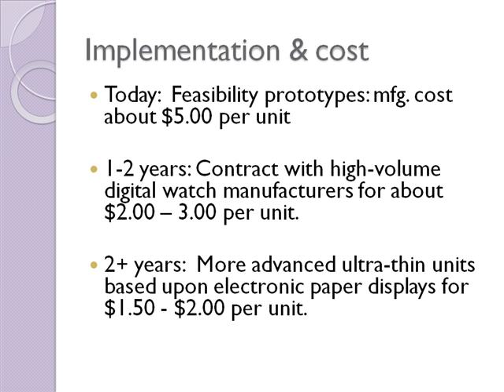In terms of implementation and cost for this approach, these little prototypes I'm showing here cost $5 per unit. And again, these were made on a really low budget just to show the concept to folks. If we got serious about this, one way to go might be to contract with high volume electronics manufacturers, for example, digital watch manufacturers. Chinese manufacturers, as an example, pump out tens of millions of digital watch chassis for under $1 each right now.